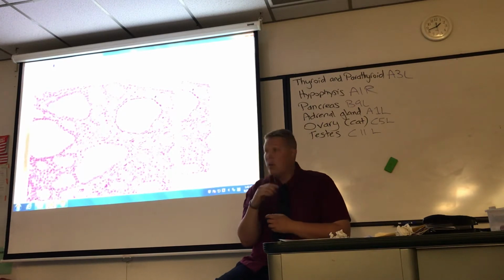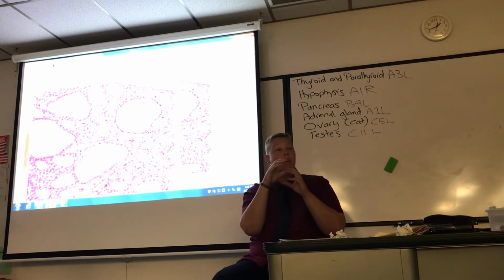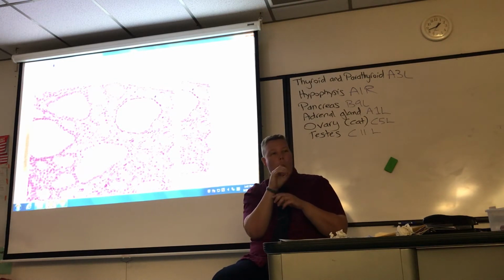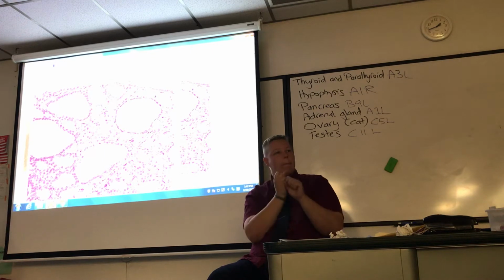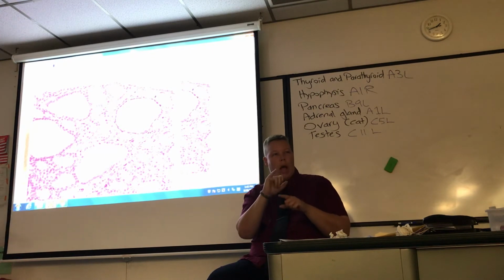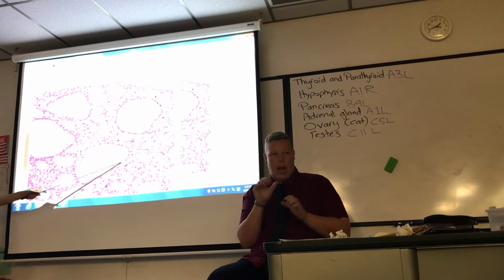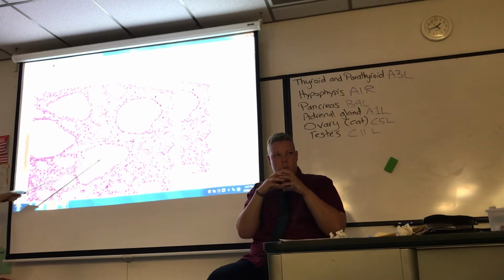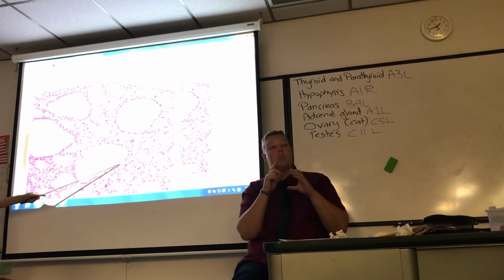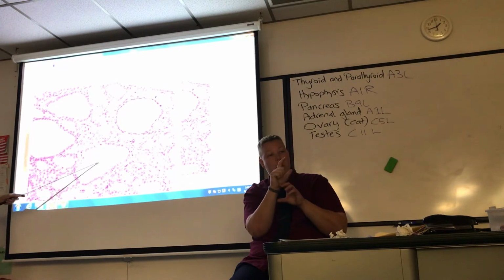They have to first extract iodide from the blood, okay, to do that from your diet, like table salt, sodium iodide. And so because cells can't make the iodide, they have to extract it, and there's physiology there. I can teach that on Friday. They kind of have to store the inactive form here. Okay, so that's why there's this follicle structure. To be able to identify this whole thing as a follicle, the cells that surround it are follicle cells of the thyroid. The stuff in the middle, just call it colloid.